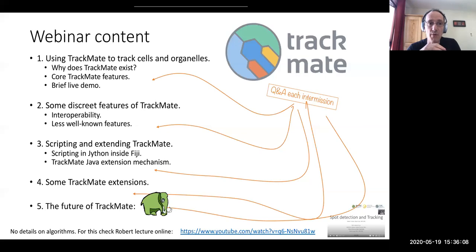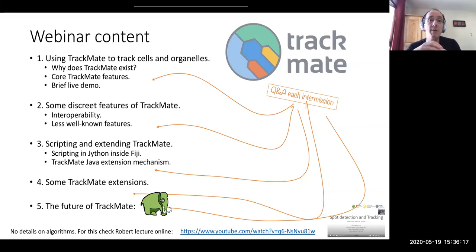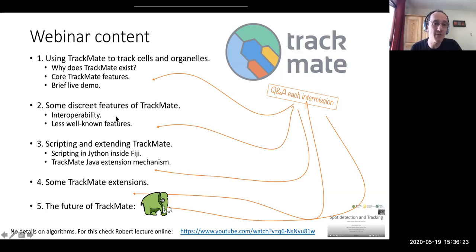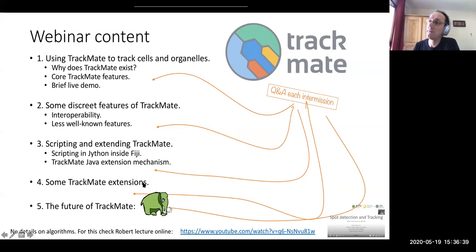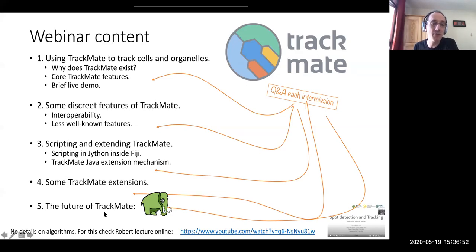The first part is simply how to use TrackMate with a brief live demo. After that, since the Nubias Academy audience is pretty advanced, I would like to show some discrete features of TrackMate — things you probably don't know that well — how to extend TrackMate mainly with scripting, and also the extension mechanisms. I would like to publicize some TrackMate extensions that make it go further in scope. I didn't write all these extensions, and every time I will tell you who to contact. And finally, I conclude with the future of TrackMate.